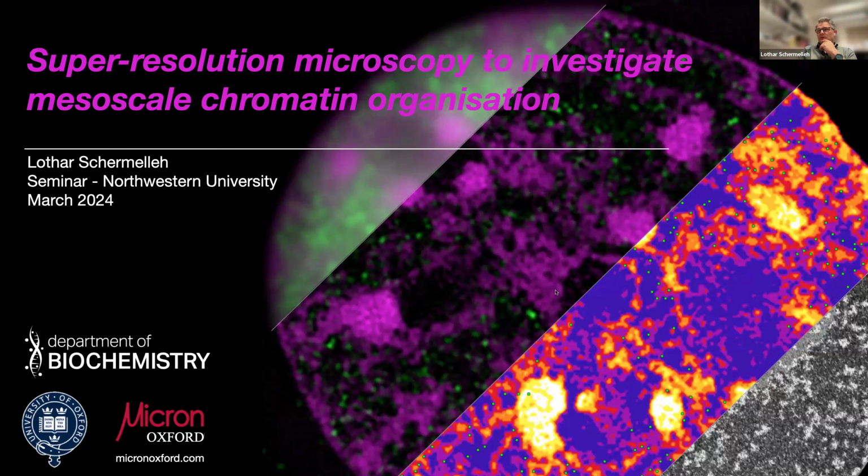But what we're of course more interested in is to analyze the data and get meaningful quantitative information that really informs us about the underlying biology, and then of course also use other techniques, imaging and other molecular methods, to cross-validate our findings. So for instance, electron microscopy.